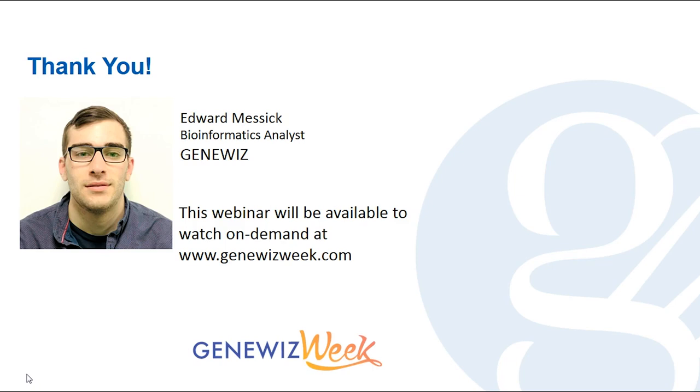So the targeted approach isn't going to be as good at distinguishing species because you're using one part of their genome rather than the entire genome, where you're going to find more differences. But there is a problem with the databases in that often species have very similar genomes. So that's where you can do binning and you can do some curation of your database to make sure that you can clearly distinguish species.